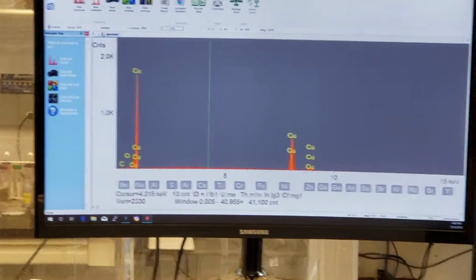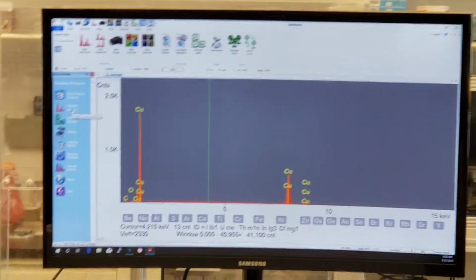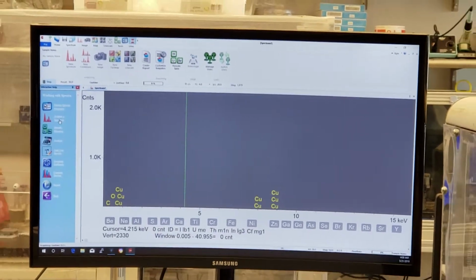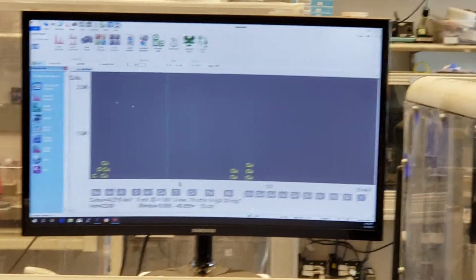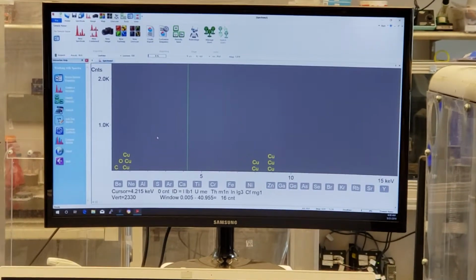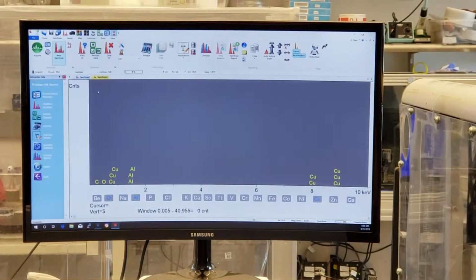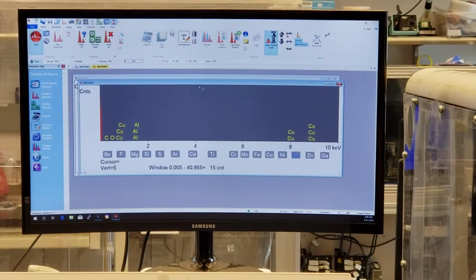So for right now, if I selected interactive help again, and if I go acquire spectra, it would open up a brand new window. It did on the same window. Sorry about that. I messed that up. It should have opened up. If I had a new spectra, it would open up a new spectra window. So you have 2 spectra windows now. Hang on, let me shrink them. So I've got 1 and 1 makes 2.